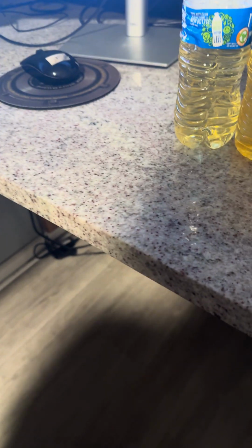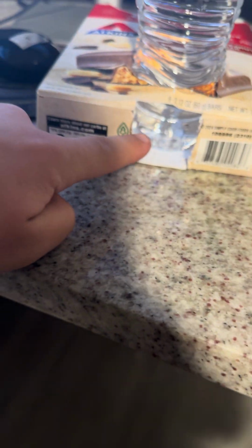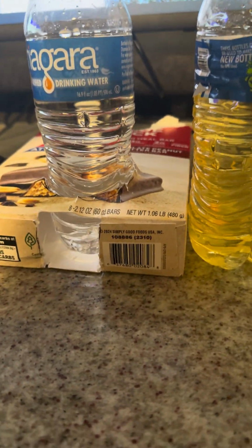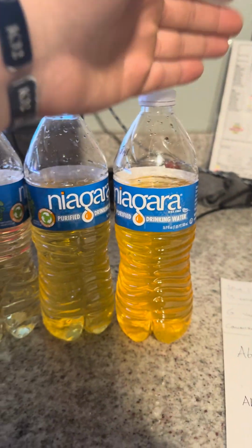For my makeup lab video, I used orange dye against a blank of plain water in the same setup described in the YouTube video. I used orange against this blue light at 440 nanometers, and I prepared 3 different colored solutions against this blank. So we had 0 additive, 5 mLs, 10 mLs, and then 15 mLs.